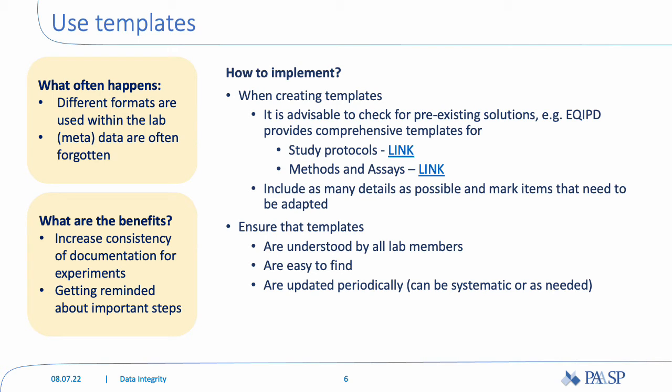Once the templates are created, it's important to ensure that all lab members understand the templates and know where to find them. For that, maybe a short training is necessary, and a common database can also be very helpful. It is also important to update the templates periodically. This can be systematic, like once per year or as needed.